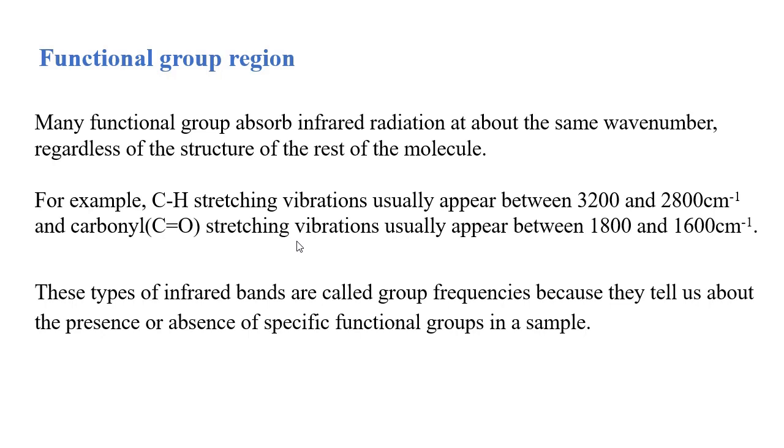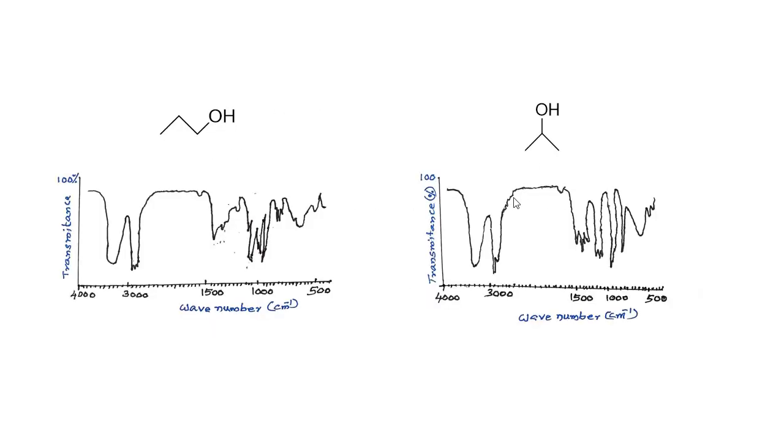Then see these two infrared spectra. This one is of 1-propanol and this spectrum is of 2-propanol.